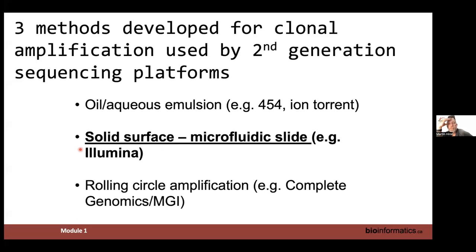The other way to do it is using a solid surface. And this is the technology that really launched Solexa and then Illumina, and probably the technology that you'll most likely be engaged in with ChIP sequencing, although that's changing. And this uses essentially a solid surface or a microfluidic slide to actually do the cluster generation, as I'll talk about in a minute.